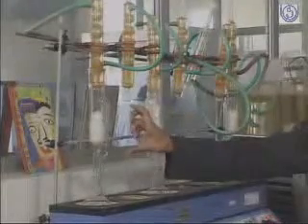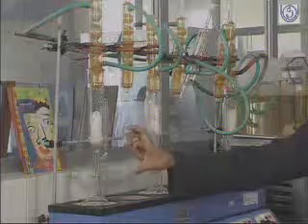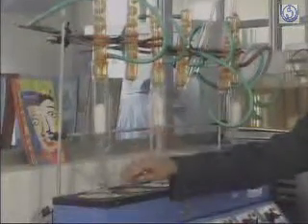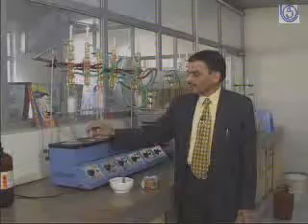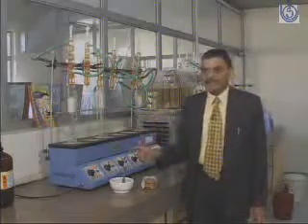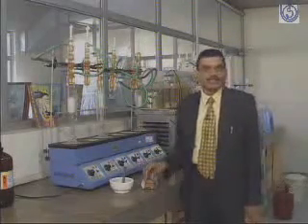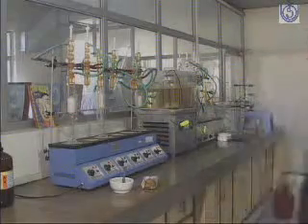After a certain hour of extraction, like you see, the ether is going down, and the fat is dissolved into the ether, and ether along with the fat is collected into the flask. The flask is taken out, and the ether is evaporated, and the fat content is weighed on the analytical balance, and we know what percentage of fat is there in the biscuit. Now I'll inform about another equipment.